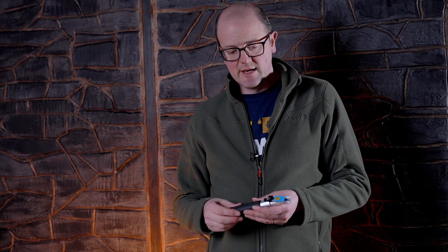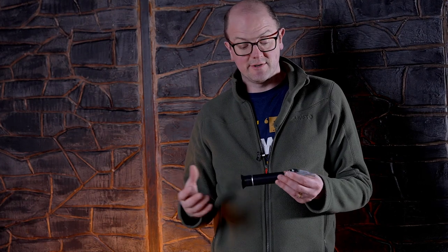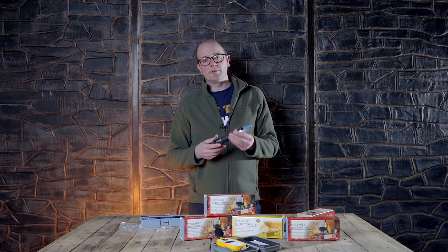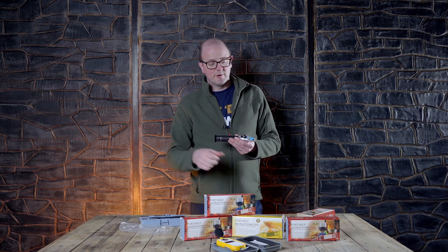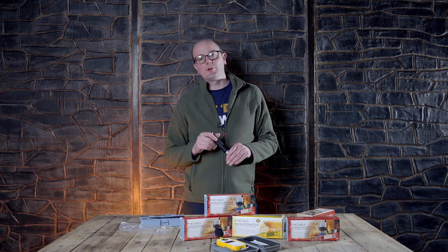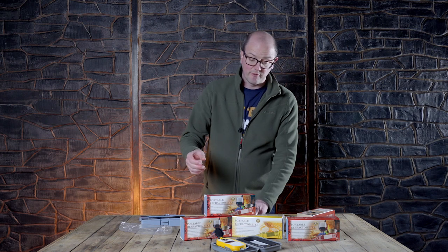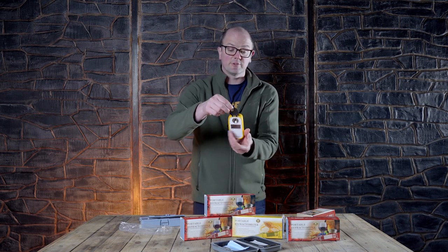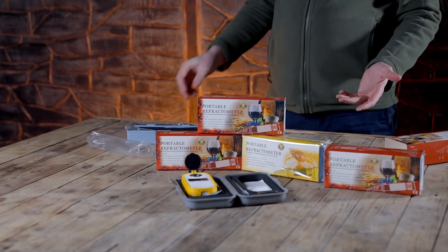Like everything we stock at Get A Brewed, there are different quality refractometers to suit every budget. There are basic ones that read your starting gravity and final gravity. Then you have the LED one that back-lights it for you. There's one for mead, one for winemaking to check the Brix and sugar content of the grape must, one for distilled alcohol, and then we've also got the electronic version if you want a premium quality piece of kit.